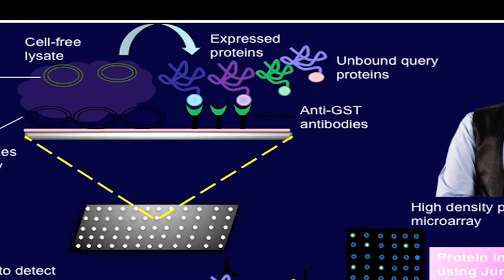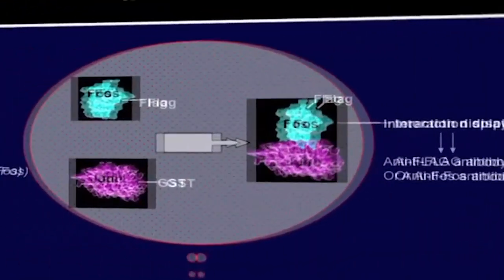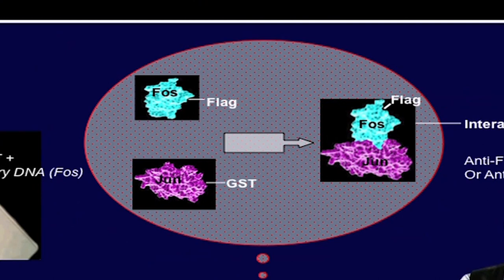In addition to showing that protein expression and protein interaction works, it was also interesting to perform the co-expression, where authors showed that even the query protein need not be purified and one could express that DNA along with the in vitro transcription translation mix printed on the protein chip surface. So, if you have protein microarrays, features are printed on the chip and then you have generated the contents by using a cell-free expression based system. Now, you want to study the interaction, and for that you have to purify a protein and use it as interactor. By using co-expression, now you can use protein specific antibody to identify the interaction, or you can use tag specific antibody to detect interactions.